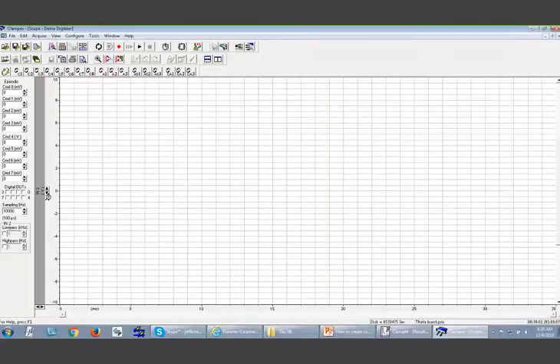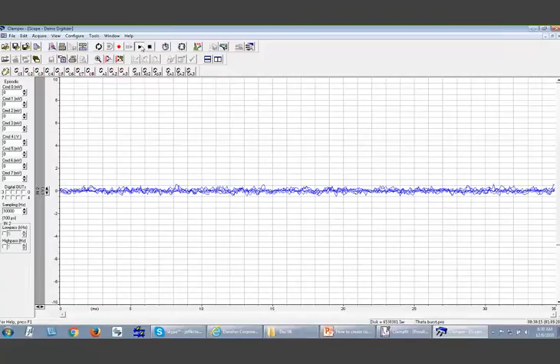Now you need to look at here. You will see it quickly. Because the time 200 milliseconds is very short, you will see here, I click here. You can see here right now is 10. You know, digital output sent out. Now wait for 20 seconds. Another will come here. Now look at here, 20 seconds.